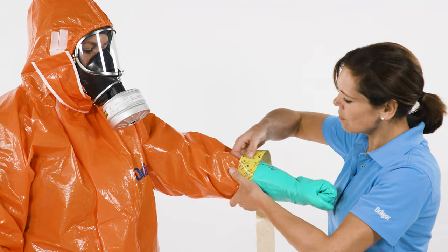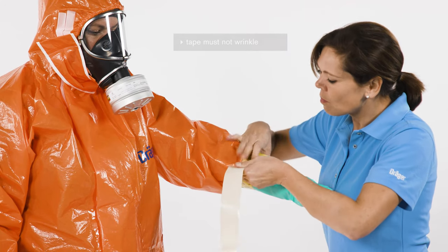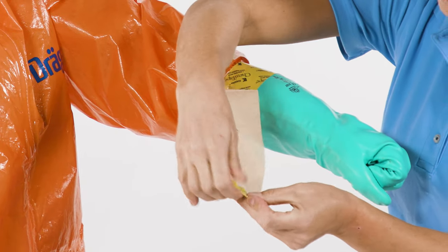Have a second person connect the gloves to the suit with a chemical-resistant adhesive tape. Make your hand into a fist before attaching the tape. Make sure that the tape does not wrinkle. Fold the tape over at the end to make it easier to remove after use.